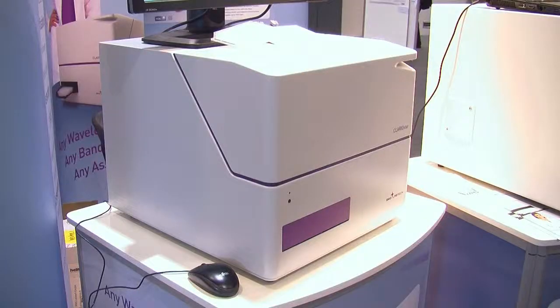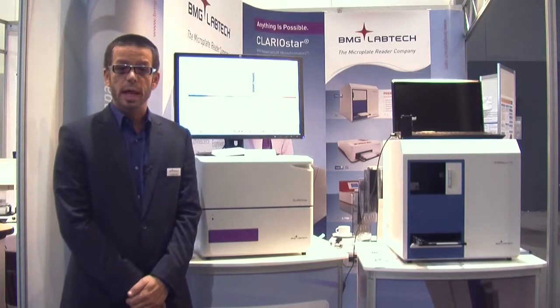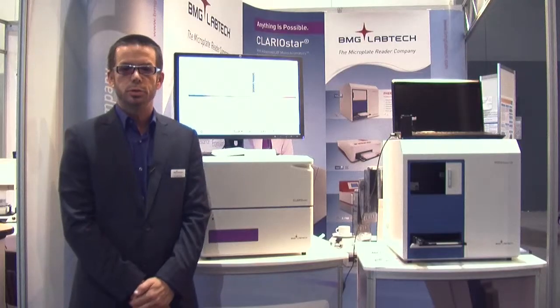One of the unique features of this reader is that it has multiple technologies to allow you to do these different detection modes. It has a monochromator for fluorescence intensity and luminescence assays. It also has filters to allow you to do fluorescence intensity, luminescence, alpha screen, FRET, BRET, and TR-FRET assays, and it also has a spectrometer to allow you to do absorbance assays. These three different technologies have been combined into one reader, so you don't have to compromise between those different detection modes.